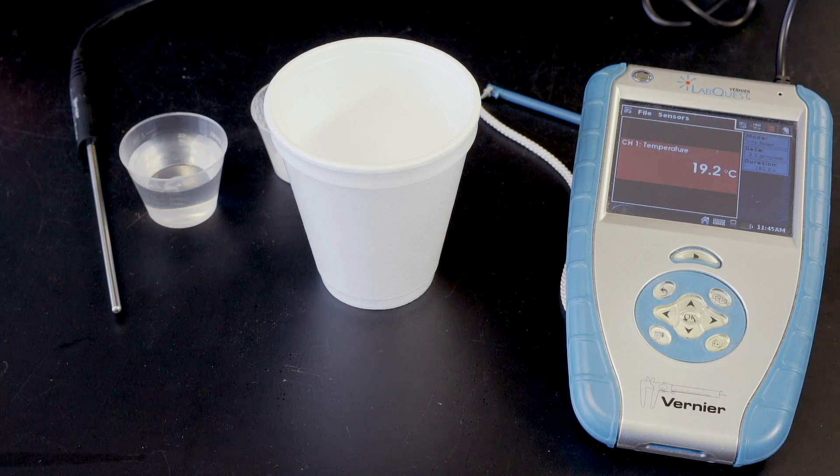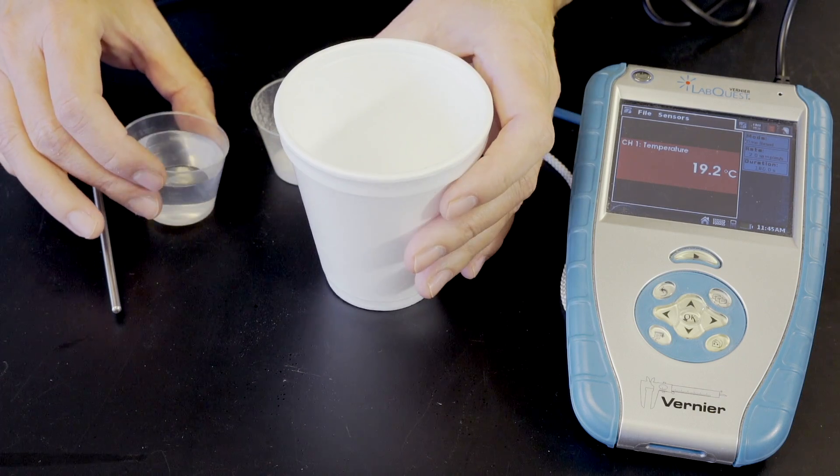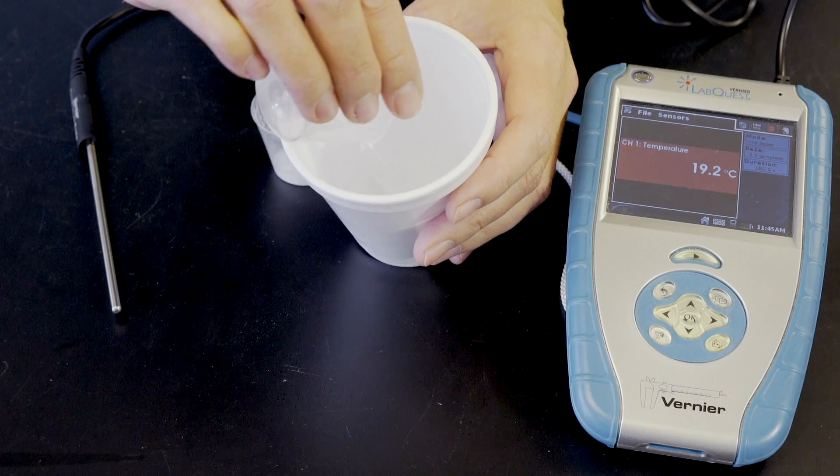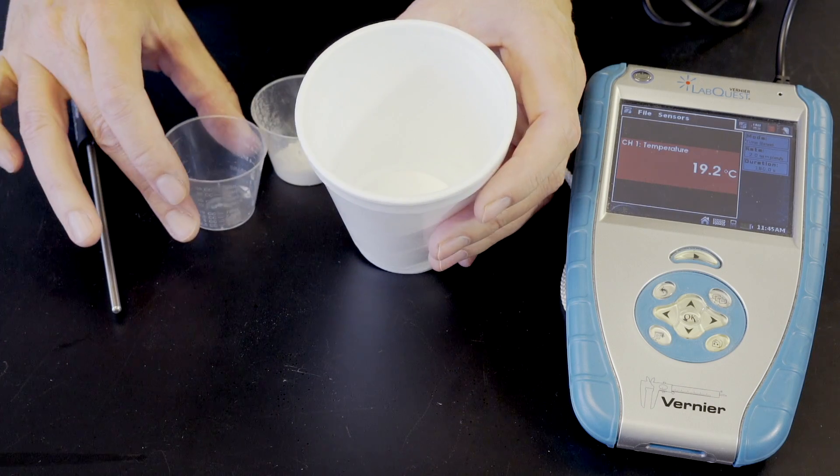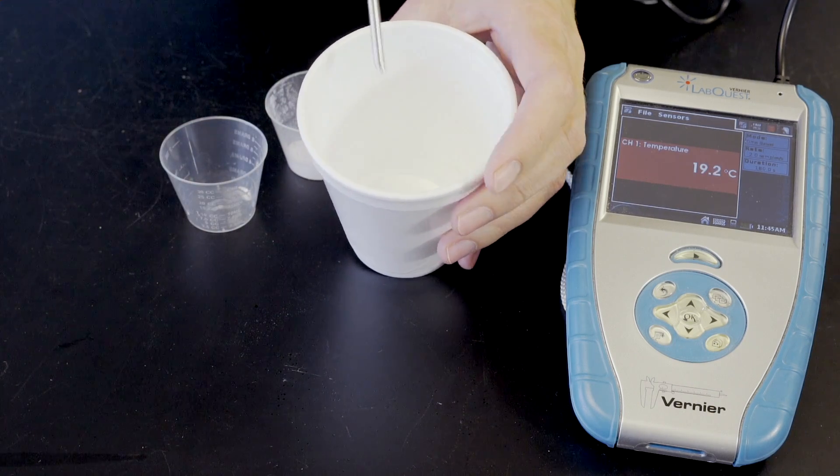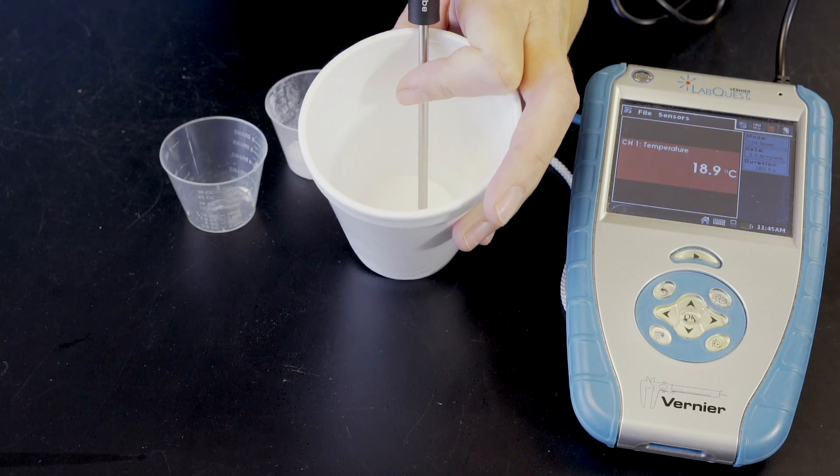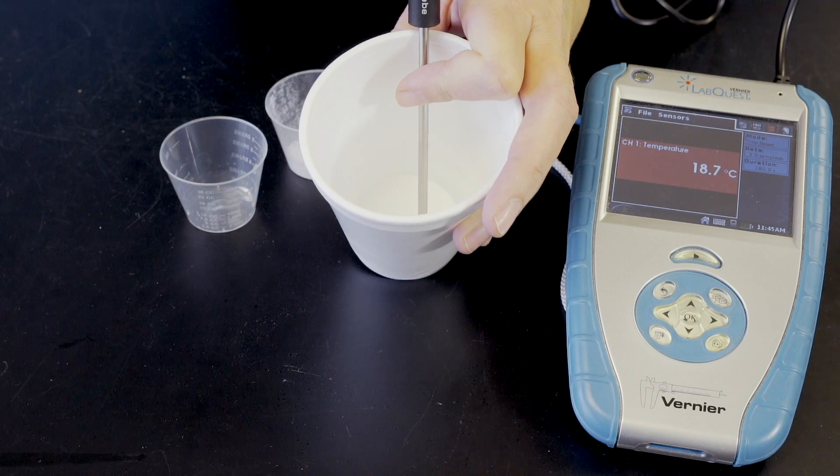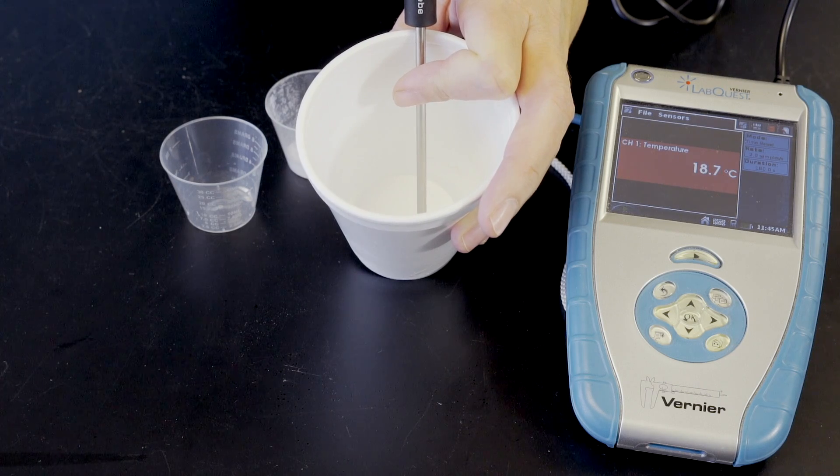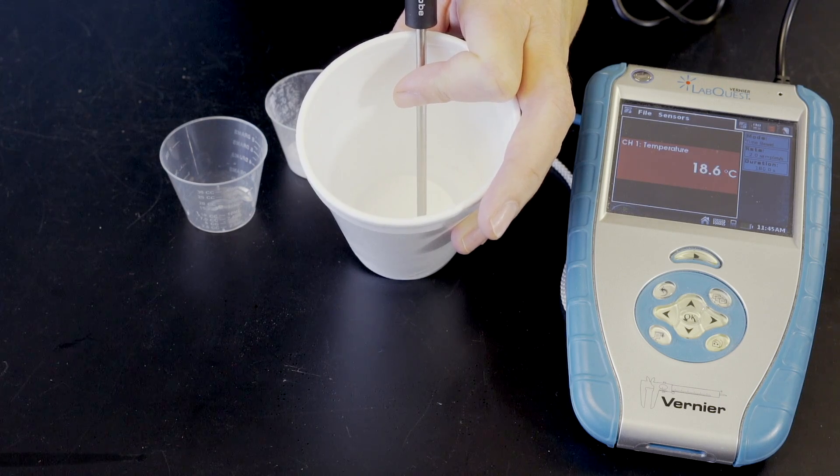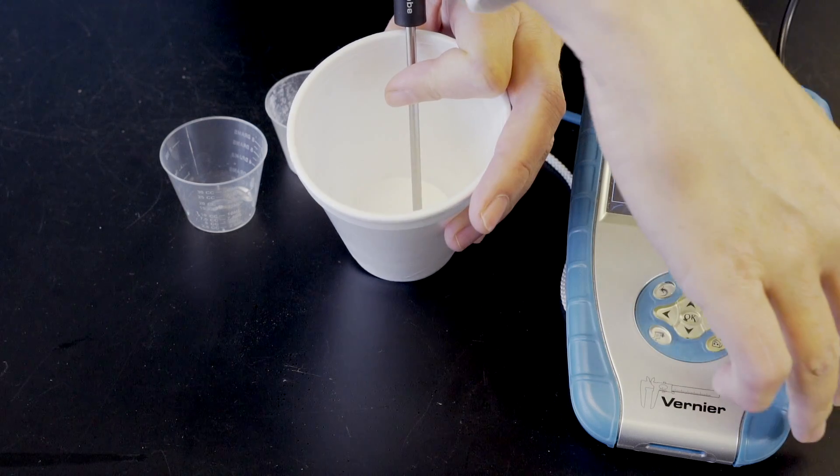In reaction 1, 30 mLs of citric acid is added to a styrofoam cup. The temperature probe is placed into the liquid, and once a stable temperature is reached, recording begins.